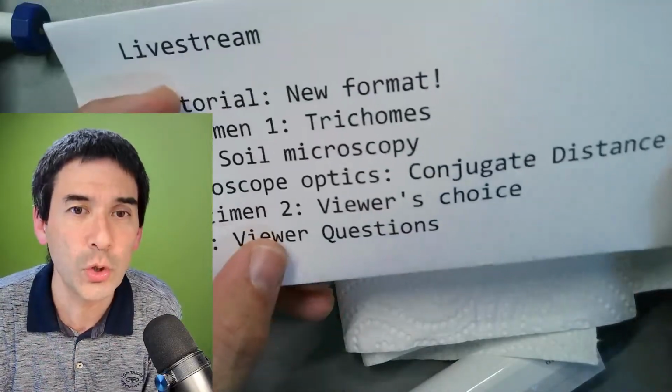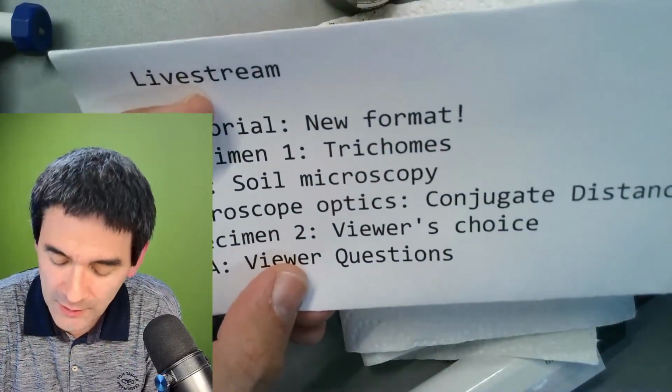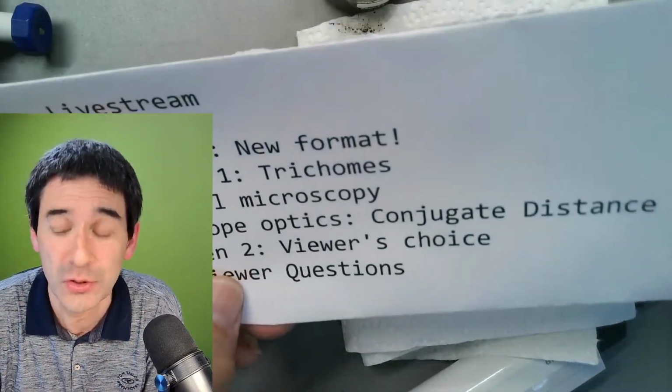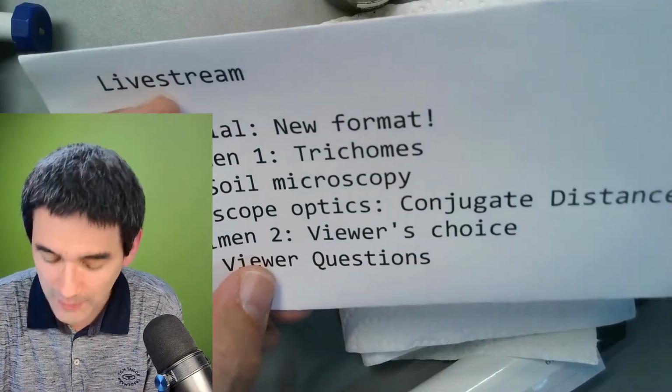The next one is conjugate. Again, a complete change in topics. I thought that every now and then I'm also going to talk a little bit about microscope hardware and optics, because some people would like to know something about that. So for 15 minutes, I'm going to talk about this.